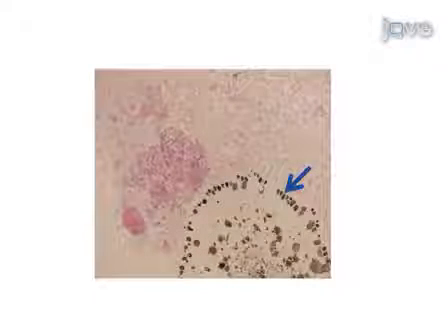Here, at low magnification, we see the impact of including an AV inked banana peel marker in the specimen on cellularity in these H&E stained sections. One can see in the image on the left that this marker allows for monitoring of the section cutting depth to get the level with good cellularity.